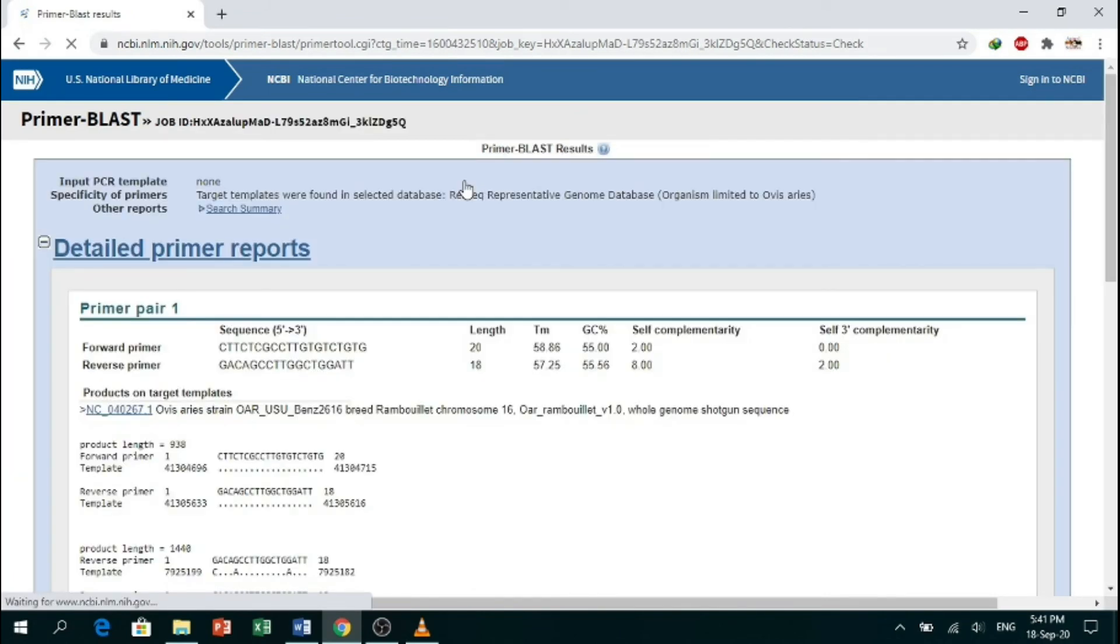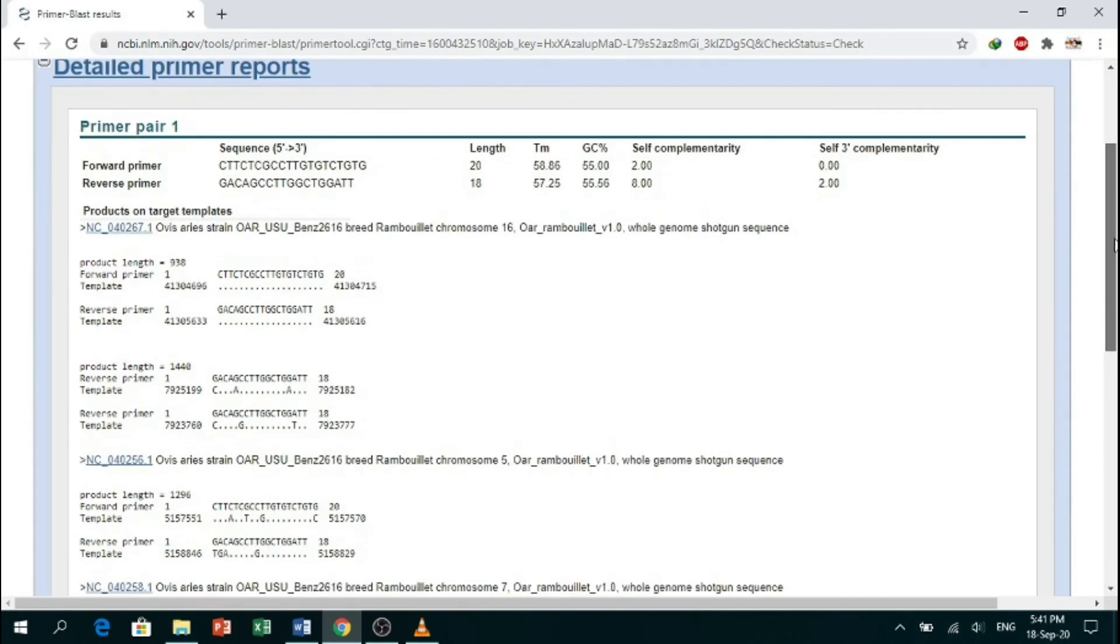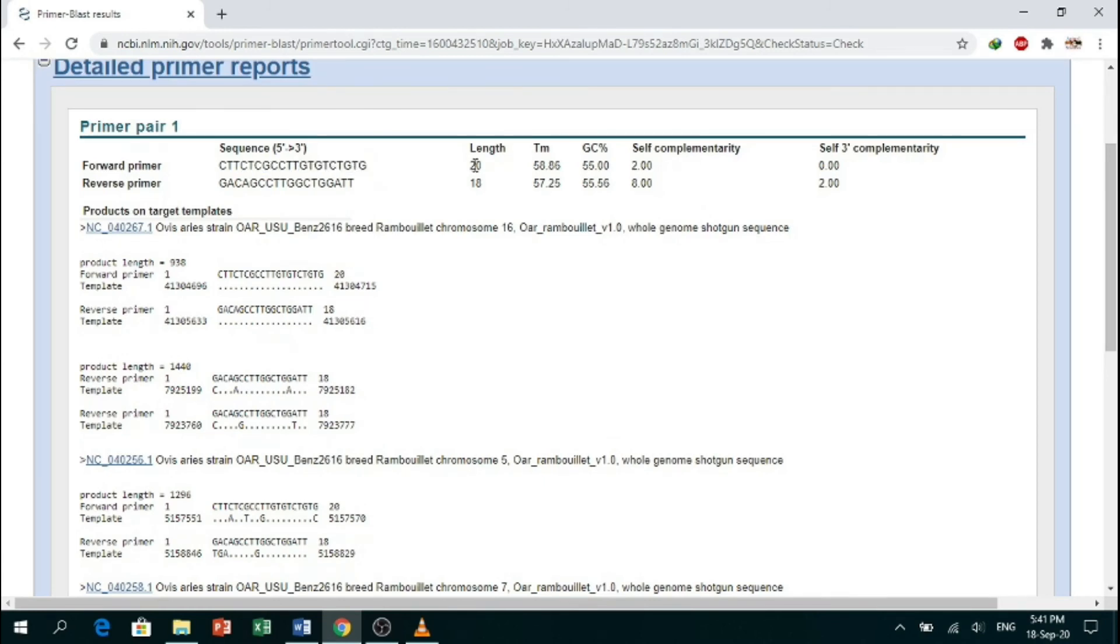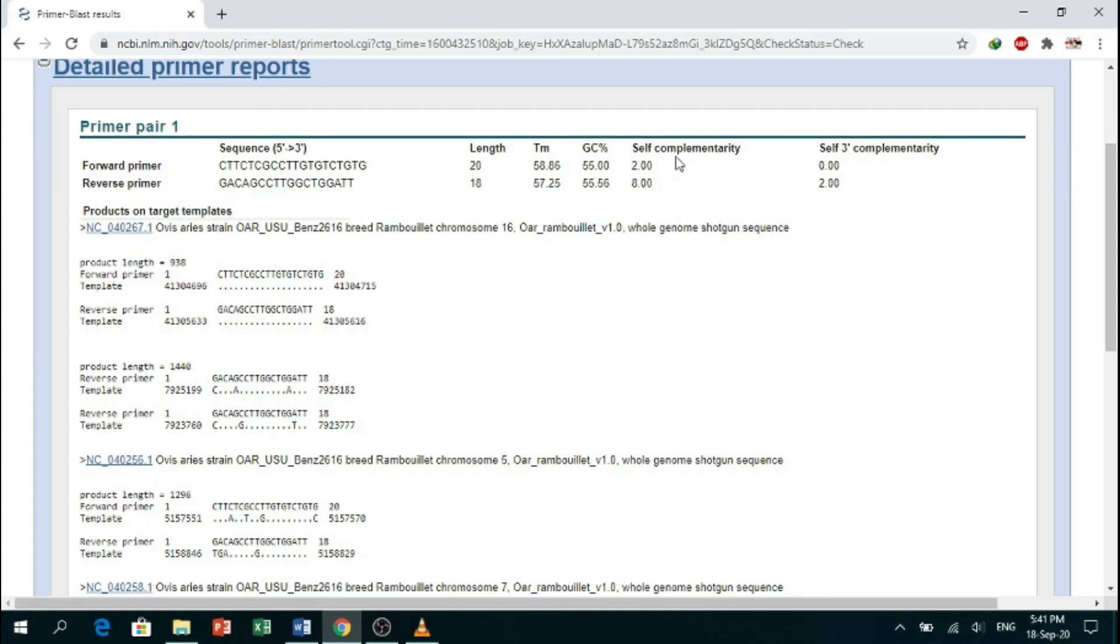And here is our detailed primer report. This was our forward primer of 20 base pair length. Its melting temperature was 58.86. Here is our reverse primer, and the GC content, self-complementarity, length—everything is given here.